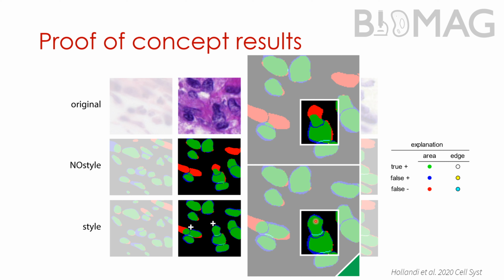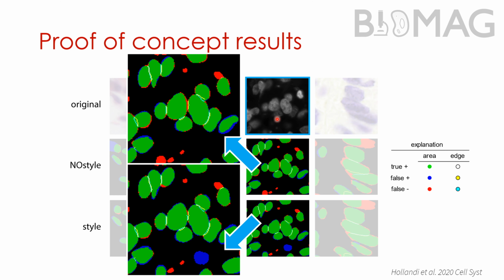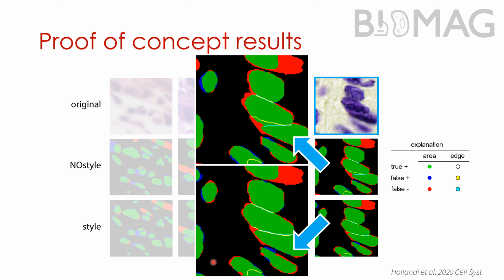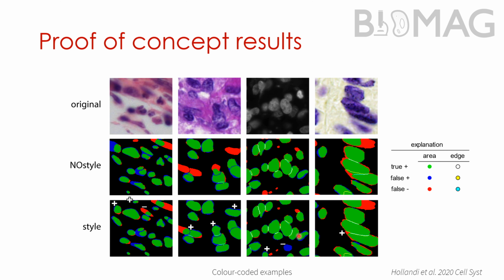And also here we detected two objects. Here you can see the dividing line, while here it was only a portion of it fused. And also we had another extra that was originally missed. This crowded fluorescent and out of focus image, we could also detect an extra object, but unfortunately introduced false detection. And in the final one, we could better identify this dividing line between the objects when using style. So, as a summary, in most cases, it actually did help.